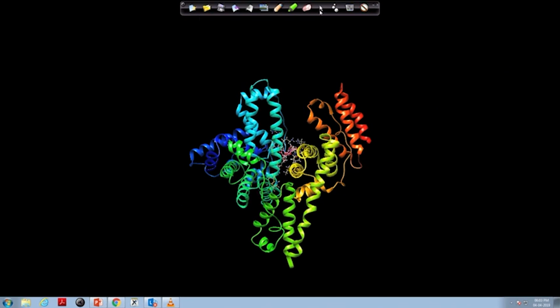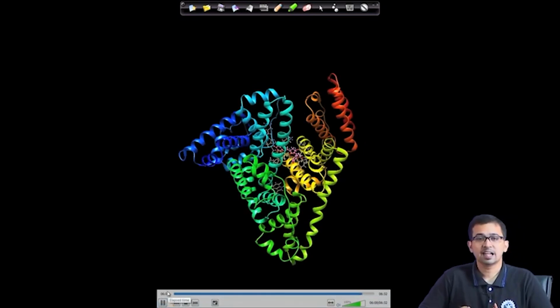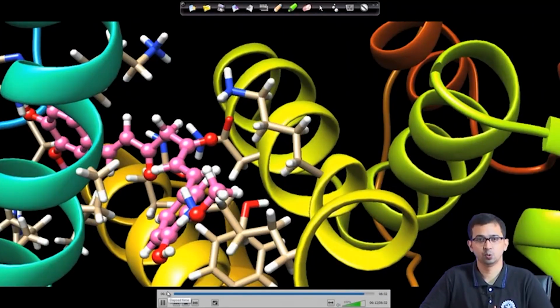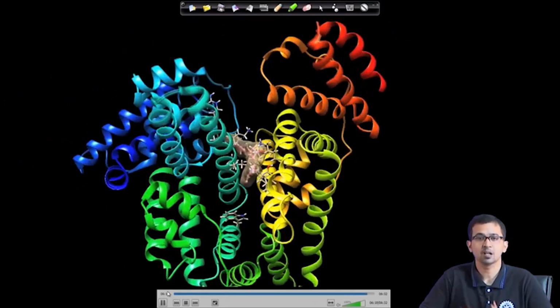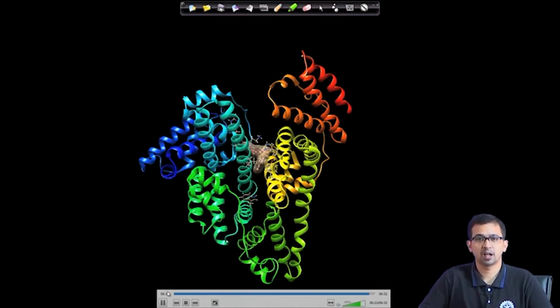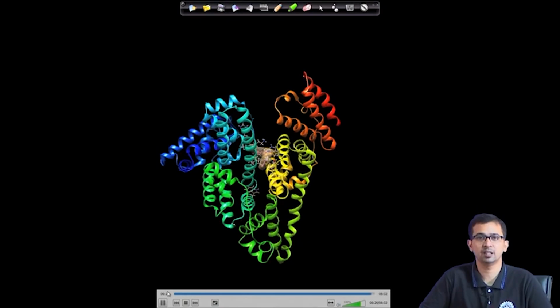So, in this study we have seen how the interaction between gallic acid and curcumin with the protein can be visualized using computational tools. These are quite at an advanced level, and are not actually in the syllabus which you are studying here. However, for an advanced study, I am showing you this, and this might be helpful in analyzing the experimental techniques.